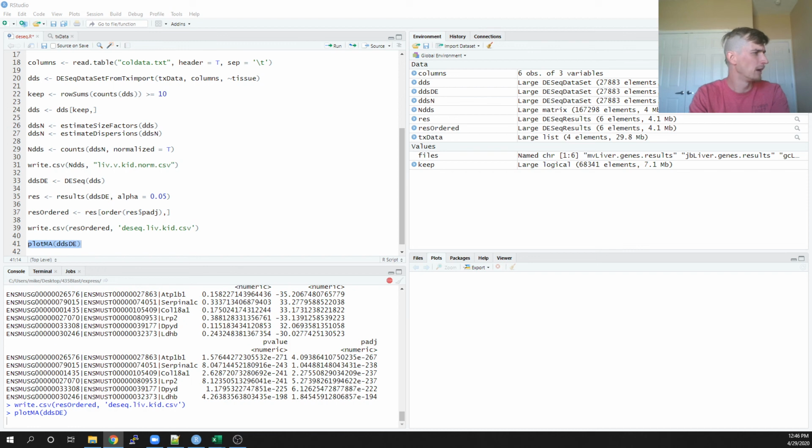I think my processors are running a little slower because I'm streaming, because this normally wouldn't take that long. I think it's just because I'm streaming and I'm occupying my processors. It's taking a little bit longer than it normally would. It'll take less time for you. My computer's complaining a little bit.